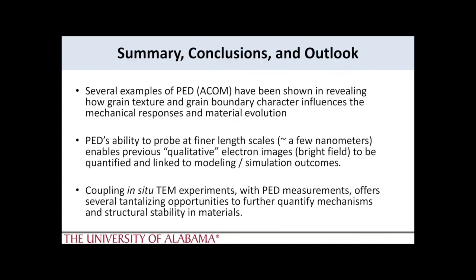I know that I've covered a lot of different examples. Again, I hope I gave a high-level perspective of how PED or ACOM, automated crystallographic orientation mapping, can be used through in situ microscopy to help reveal structures that may be masked by diffraction contrast, or correlated with other methods, where the sum is larger than the contributions of the individual components themselves. And I hope these examples illustrate those issues.